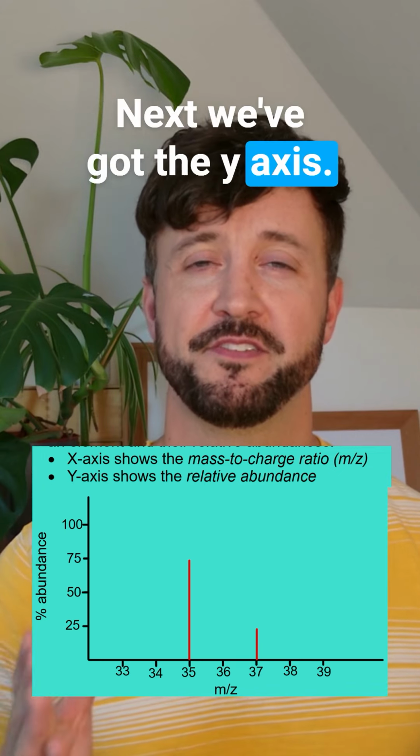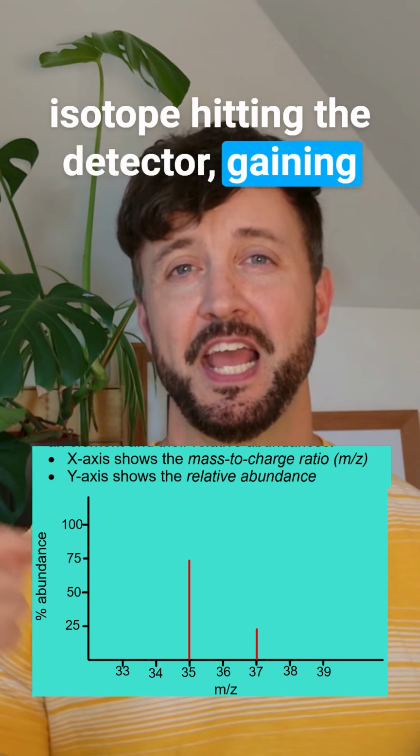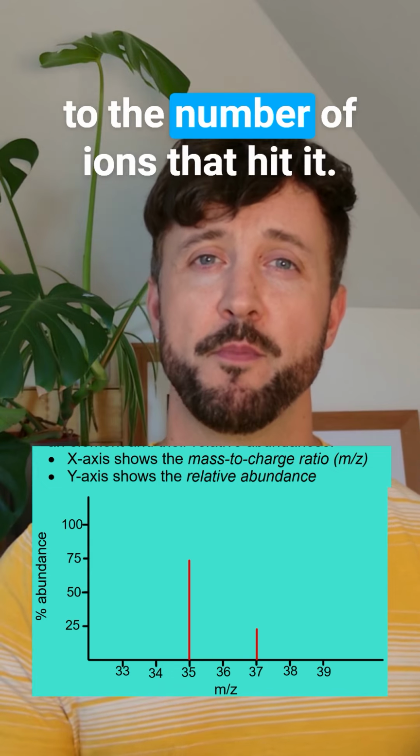Next, we've got the y-axis. The abundance is calculated by the isotope hitting the detector, gaining electrons and creating a current. That current is directly proportional to the number of ions that hit it.